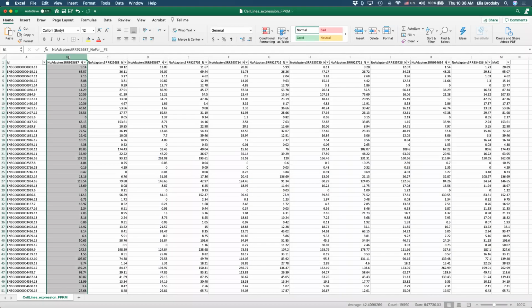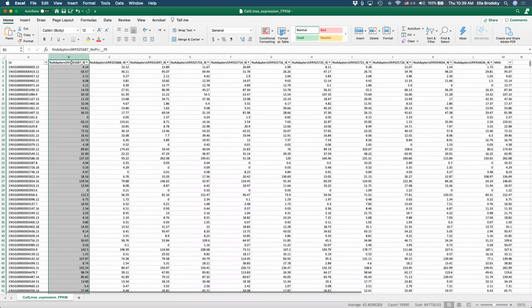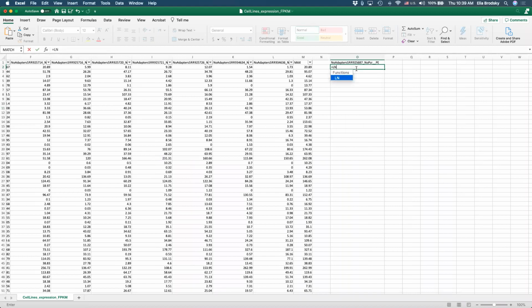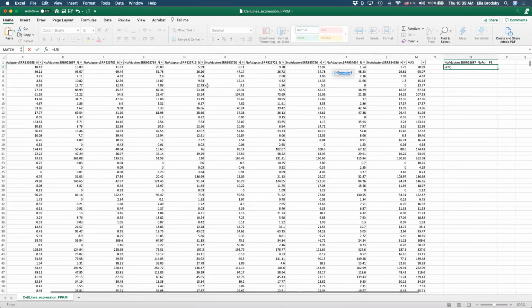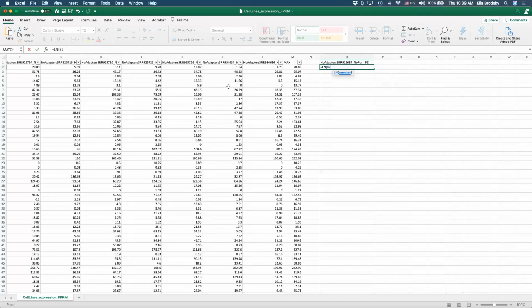We already saw here the histogram of this sample, right? So let's do the same over here with log scale transformation. Let's just take this sample, and we'll just do here ln, which is natural logarithm of this number, and we're going to add a 1. Why are we going to add a 1? Because if we have a 0, the logarithm of 0 is infinite, so we can't do that. And so we are going to add 1. And logarithm of 1 is 0, so it's not going to change anything, right?